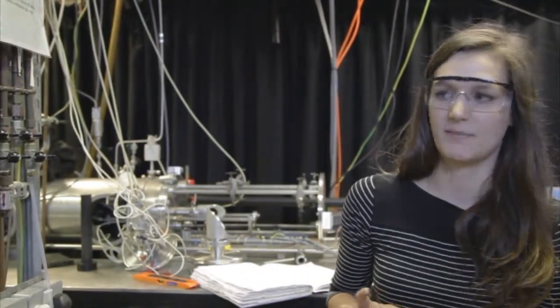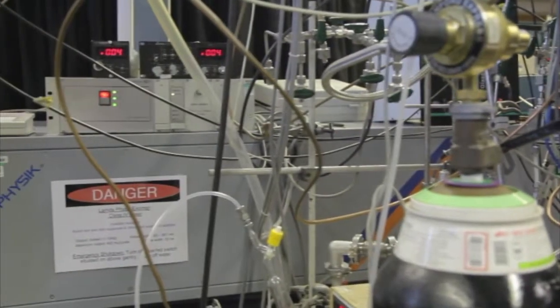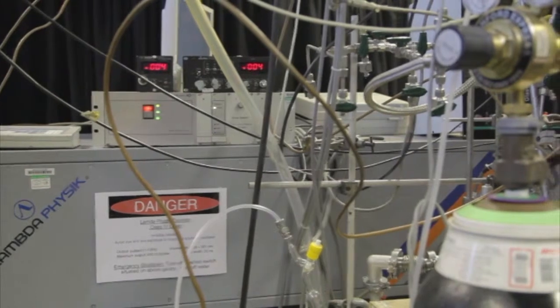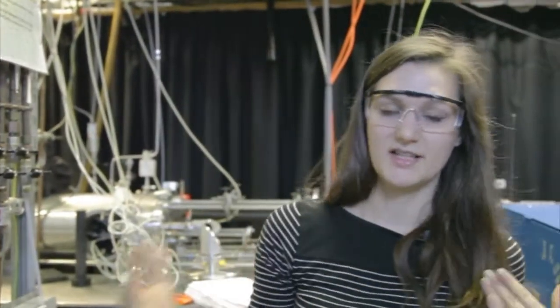The second laser that we have here, which is for the photolysis part, is the excimer laser, which is just here. And this is quite a high power UV laser which photolyzes our OH precursor, which in this reaction is tertiary butyl hydroperoxide. So we change the time delay between these two lasers, and then by changing the time delay we're looking at how quickly the OH decays over time after it's produced.